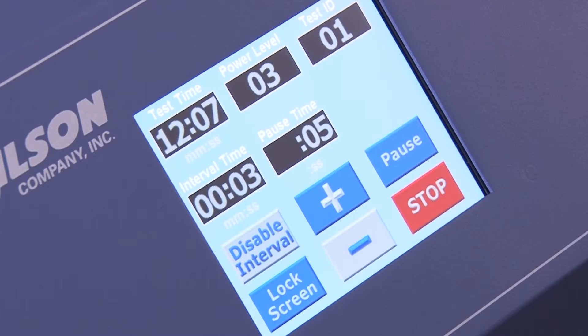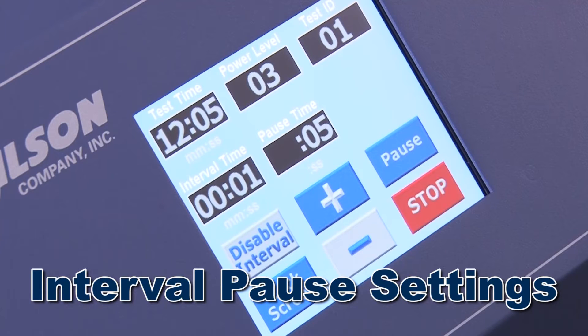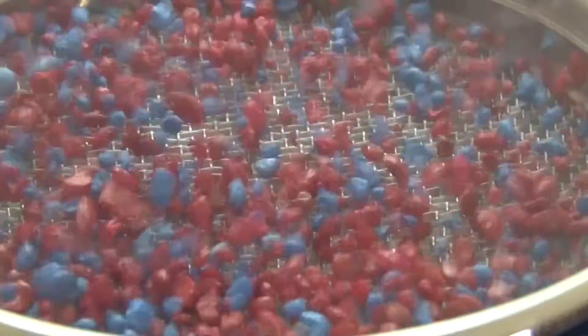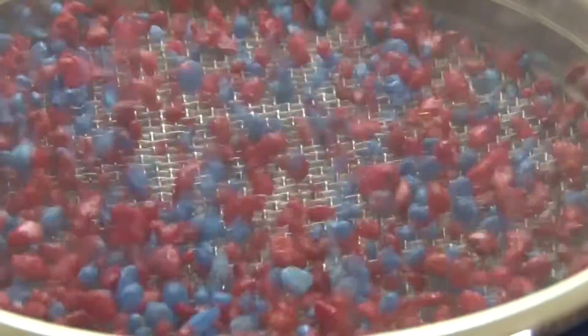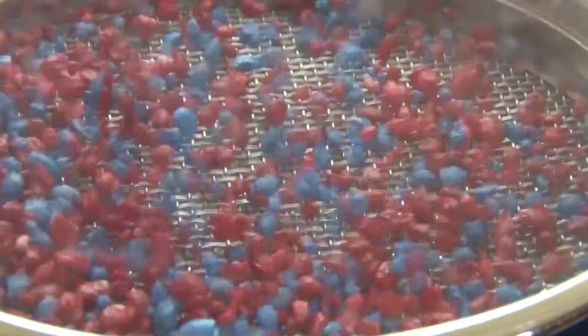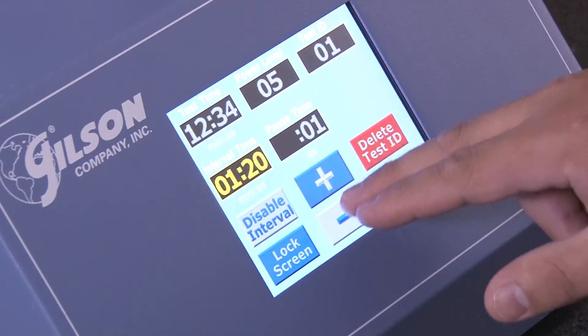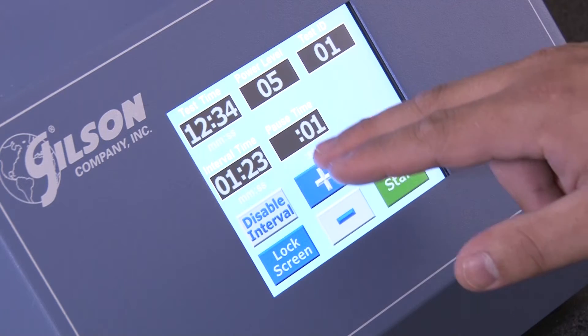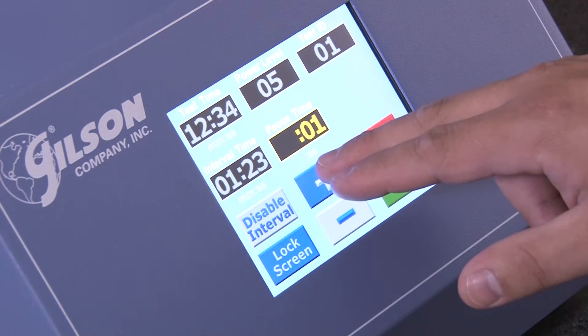The SS10 also has an interval pause feature where pre-programmed vibration pauses allow materials to come to a rest, then resumes vibration to resemble tapping action that re-orients and redistributes particles to clear the mesh. The interval pause feature is fully customizable as to the length of pause time as well as the number of pauses during the test.